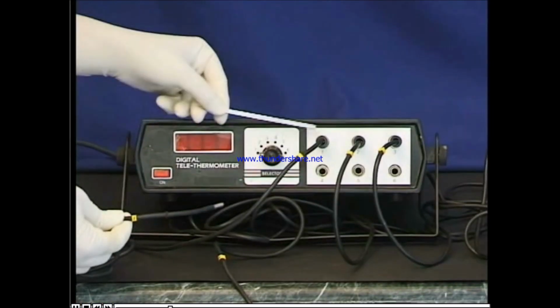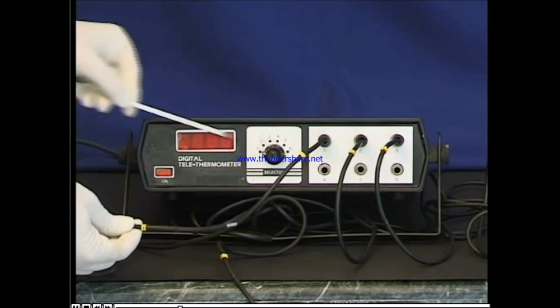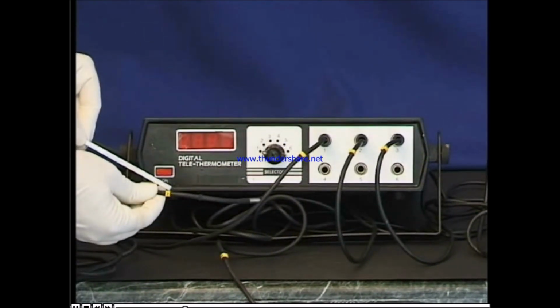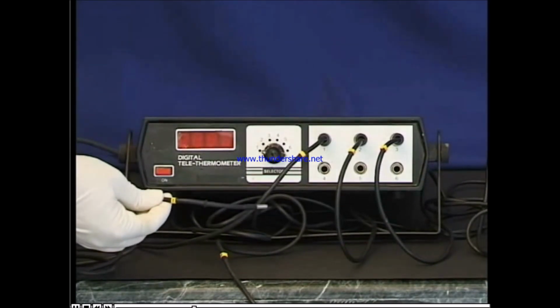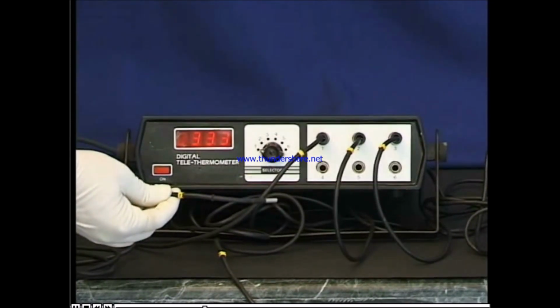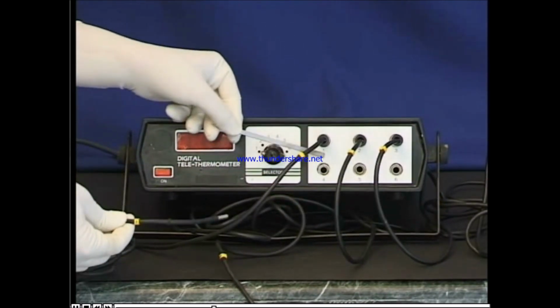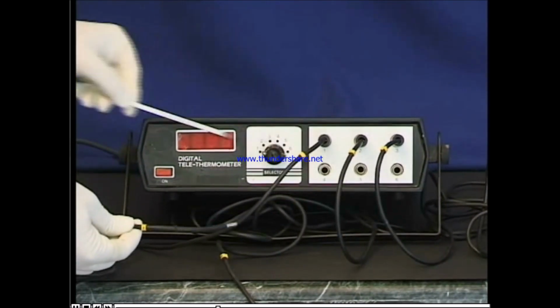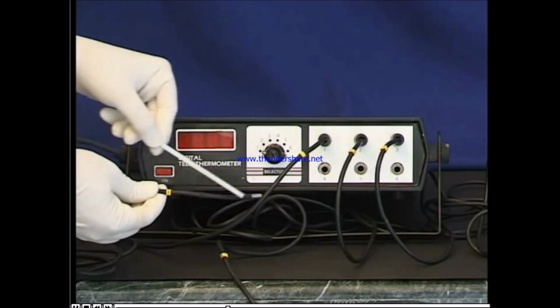An apparatus, telethermometer, with 6 probes is used for the test. It consists of mains on-off switch, digital counter, rotating knob, 6 probes and sockets for measurement of temperature. Calibration of telethermometer is a prerequisite.